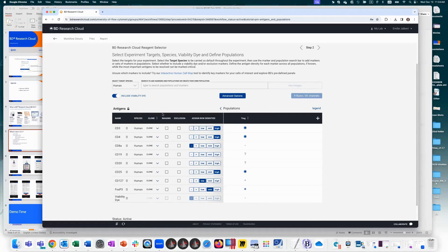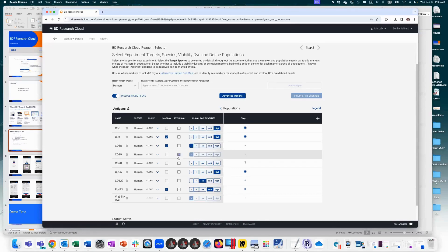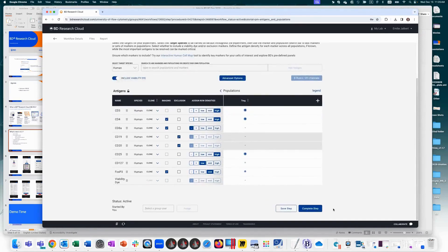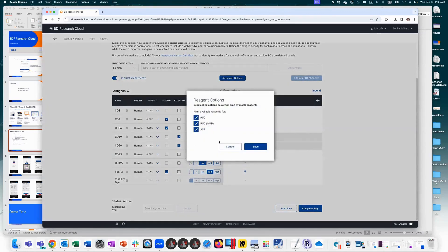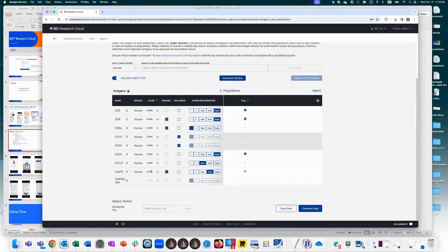What's new with the S8 is an imaging column that appears only when you've selected the S8 — not visible for non-imaging cytometers. You can choose up to three markers to visualize through imaging. There's also the exclusion column — a dump channel — where you can put more than one marker in the same color for negative selection. I'll dump my B cell markers for demonstration. You can also restrict fluorochrome options by clone preference, or leave it default to see all available.